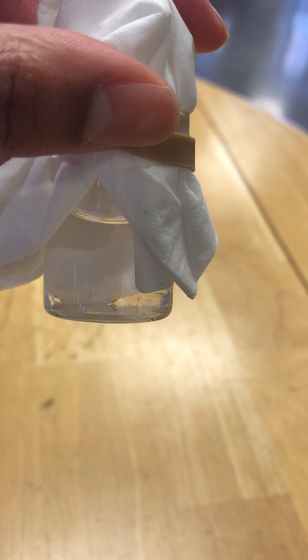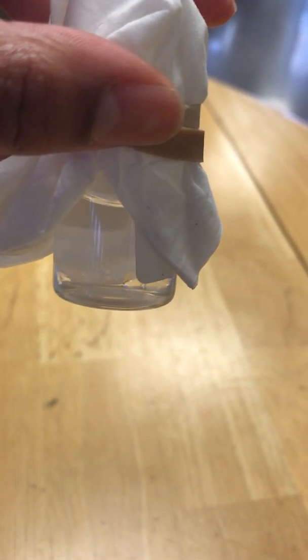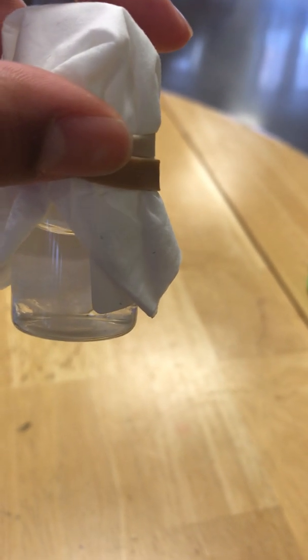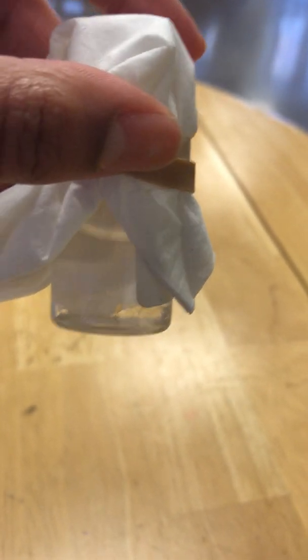The differences in clarity of the crystals are likely due to the varying amounts of impurities that remain despite my lab partner and I's attempts to clean the product. There's much less solution in the container now as well, as you can see, which makes sense because the crystals are forming as the solution evaporates, so there's less solution because the solution's evaporating.